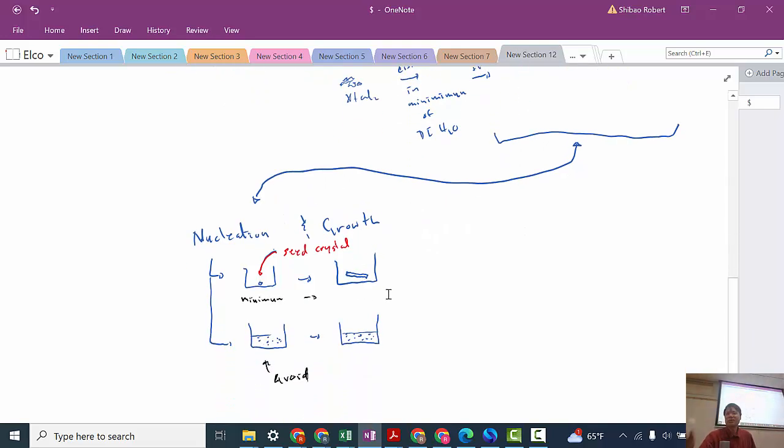You don't have to get crystals that big, and if you get crystals bigger, that's even better. But those are pretty big crystals. Those are the biggest I've seen, so that's why I kept them. Most people don't get crystals that big, so don't worry if your crystals don't look like that. Okay. Are there any questions regarding this?